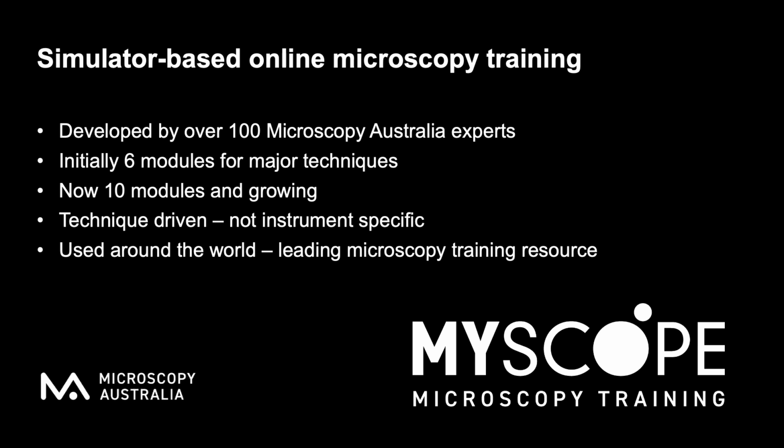Initially, we got this going 10 years ago, we started developing MyScope, and initially 6 modules were developed for the major techniques. We now have 10 modules, and this is growing constantly. We're revamping the old modules and adding new ones. So when you go to MyScope, you will see that some of them are still the old modules with simulators requiring Flash. Others are being updated and have the new simulators, and they will all have the new simulators by the end of the year, by the time that Flash is no longer available.